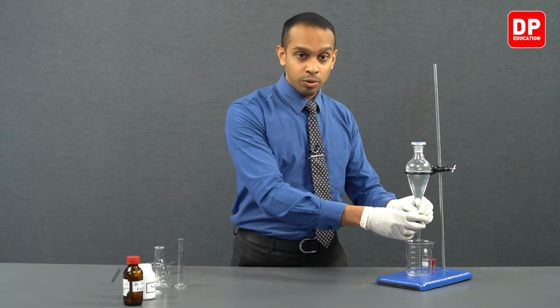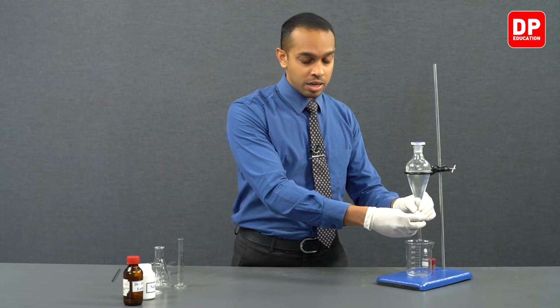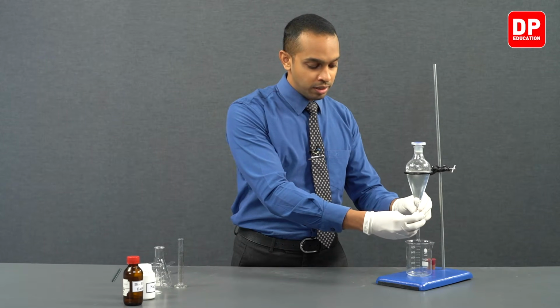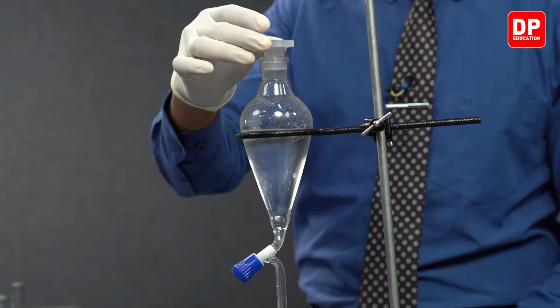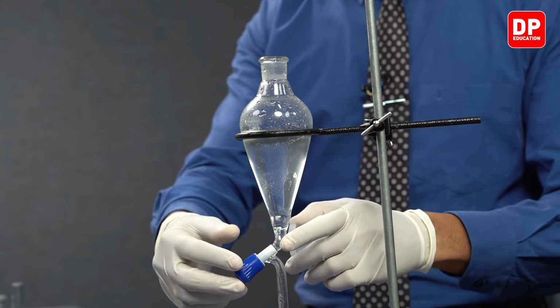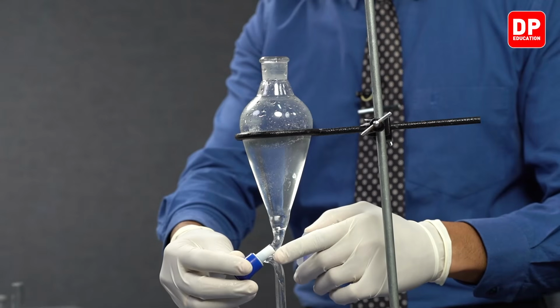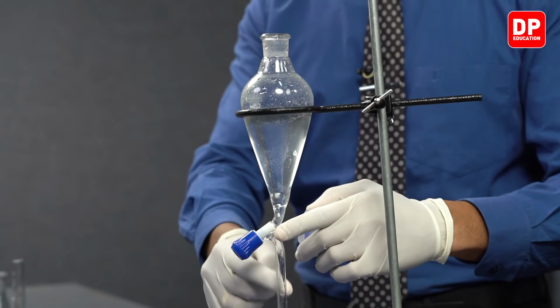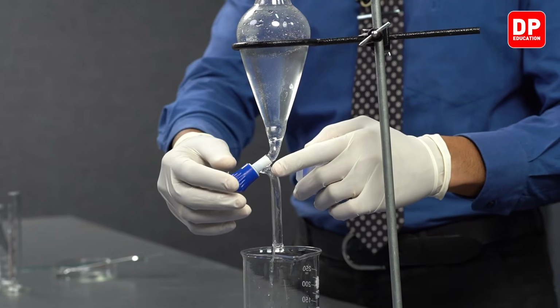And now let's turn this stopcock and allow the aqueous layer to get collected into the beaker. But students, as you turn this on, please make sure to lift this lid, otherwise the aqueous layer will not run down.